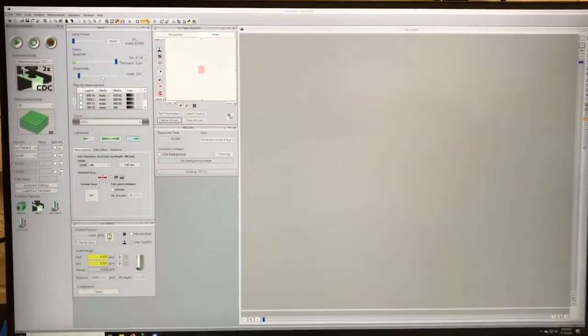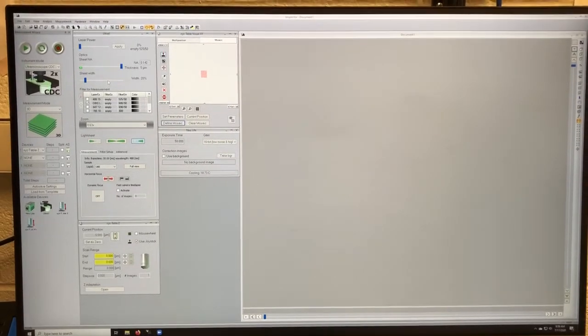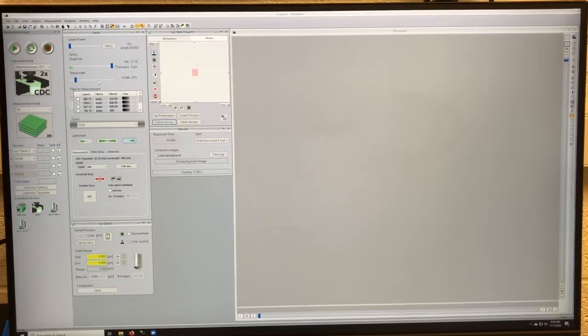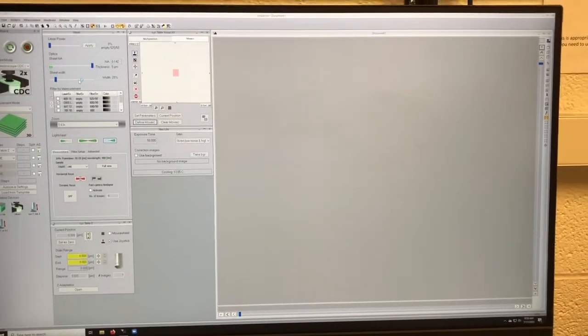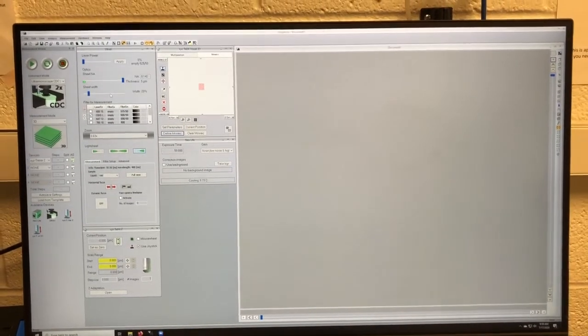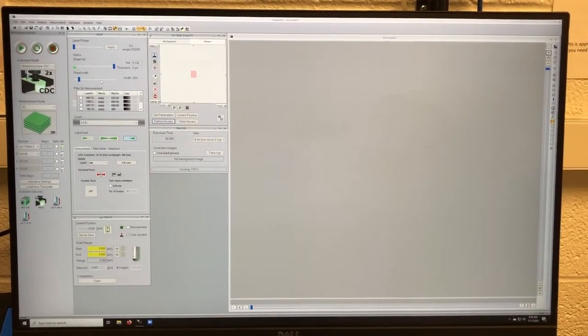Once that's done, we have the software, which I'll go into in more detail as we move forward. But the first step before we can use the software is mounting the sample — so that's the next thing I'm going to describe.